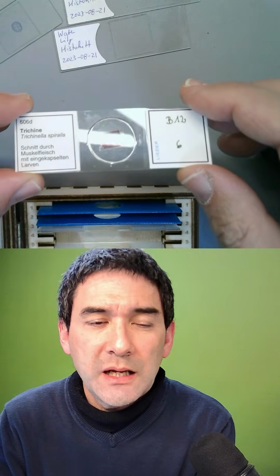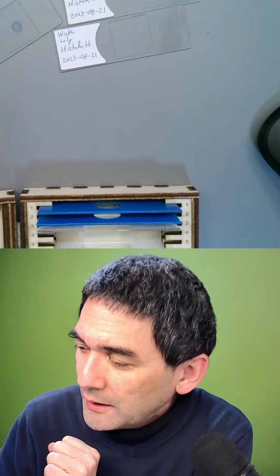Okay, you can actually see something quite interesting. I'm reading a little bit. If I'm interrupting myself, then I'm reading. You can get those close to dark field with Olympus. I need to adjust, and maybe also the lower one. There are different ways I can do that.